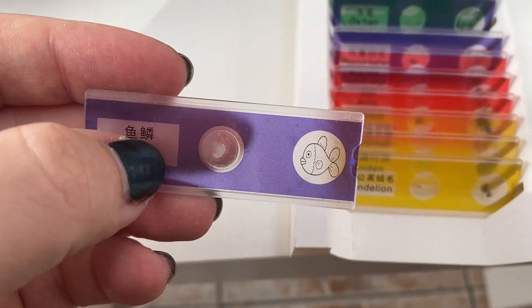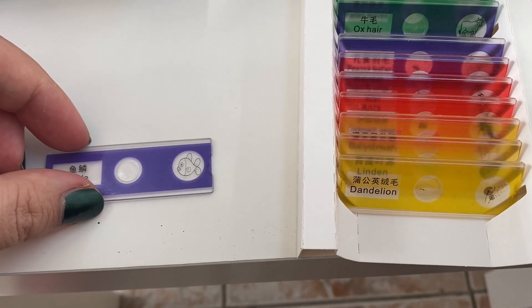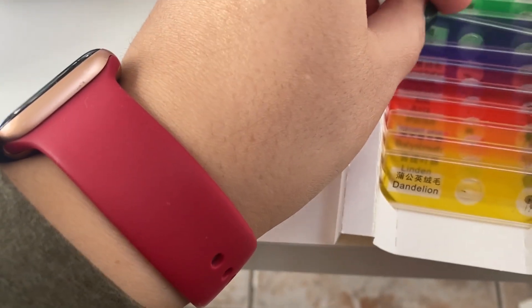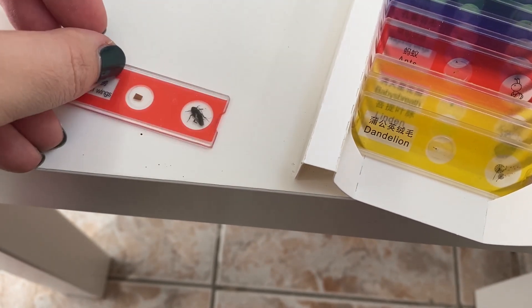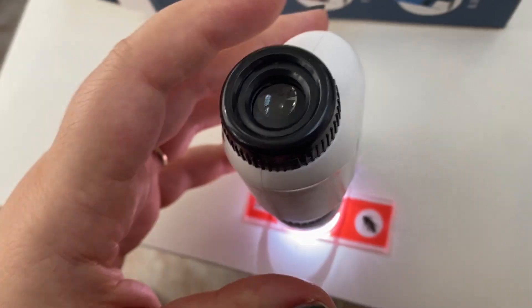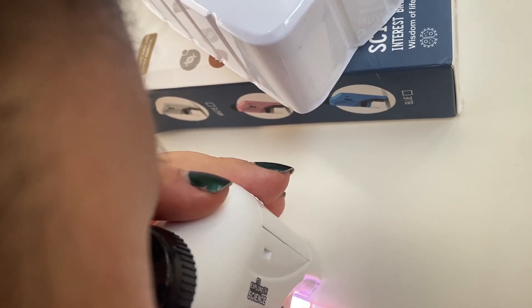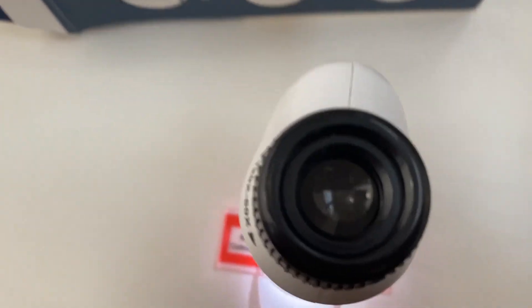So this is a scale of a fish — you can see it right here. Let me place it here. Actually, maybe that's not the best thing because it's white and my table is also white. Let's choose something else that has color — cockroach wings. Disgusting! Let's see how it looks. It takes a little bit of time. Okay, I placed it in the right place.